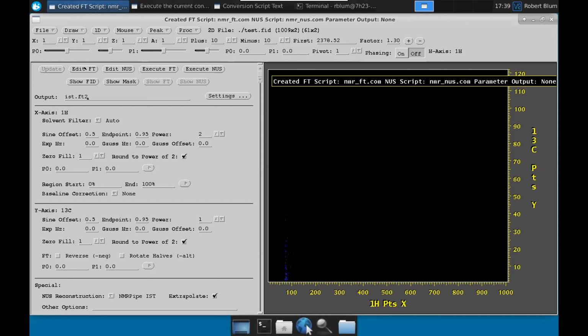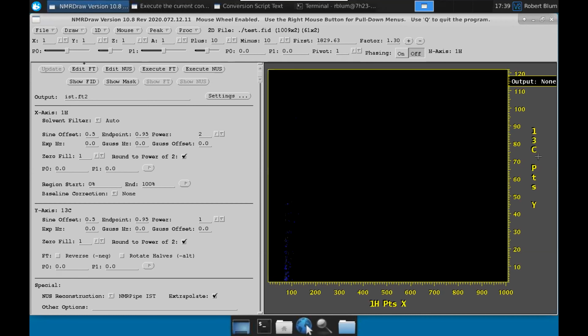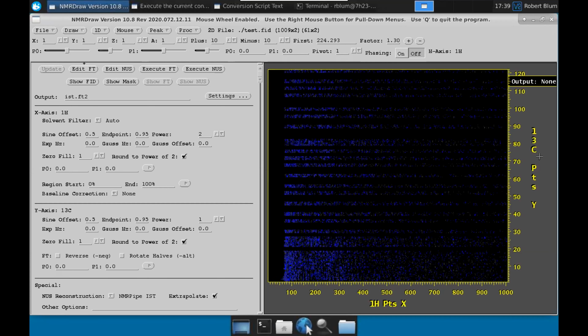So Al figured it out. Where it came from is the easy part. We know where it came from. What is the imponderable is, why is it still there? Oh God, you've got to go to Bruker for that, baby. Technical debt. That's probably why.